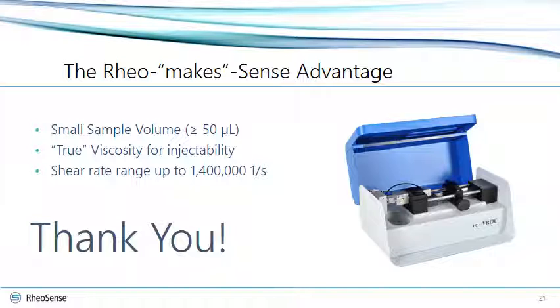We have a first question asking what are the FDA limits for drug injectability? As far as we know, there are no FDA limits for drug injectability, but there are some practical limits, as you can imagine. Automated injection systems can only apply a certain amount of force, and during manual injection as well, only so much force can be applied before causing discomfort, meaning that high viscosity materials or fluids will take much longer to inject, and that will lead to another type of problems.